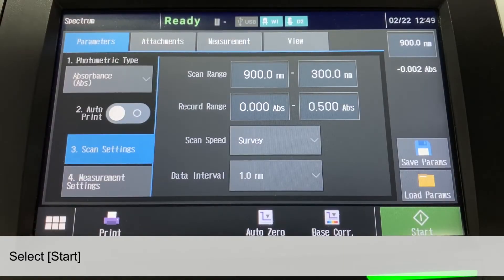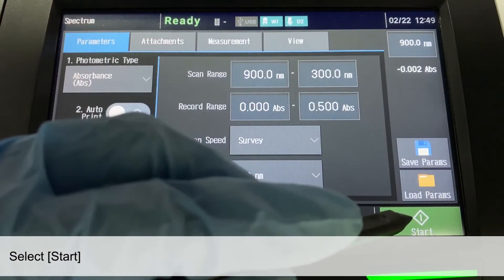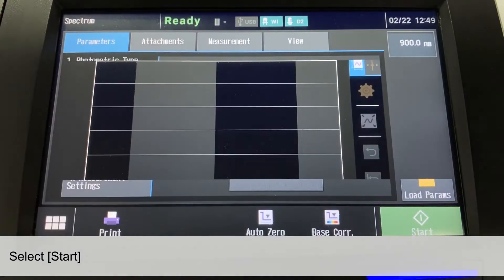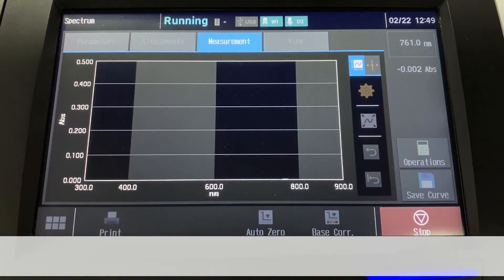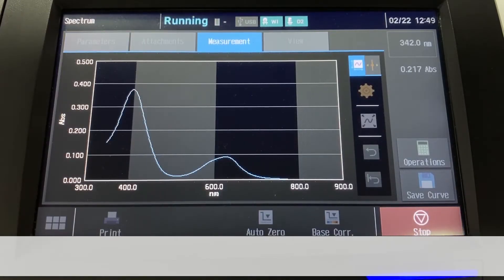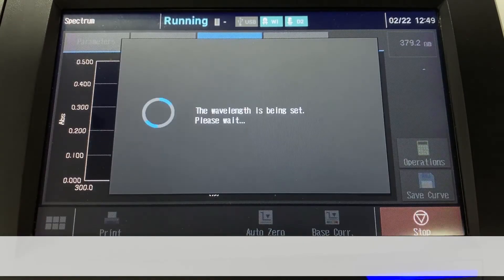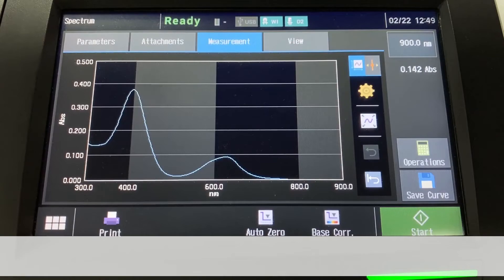Now, select Start to perform the spectrum measurement. The spectrum measured is being displayed on the measurement screen. From the spectrum, we can see some absorbance peaks.